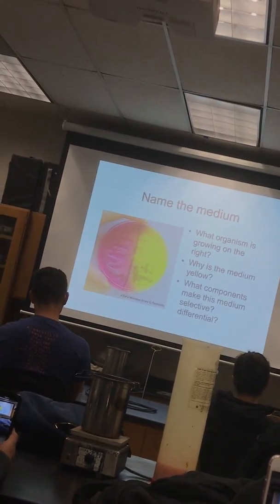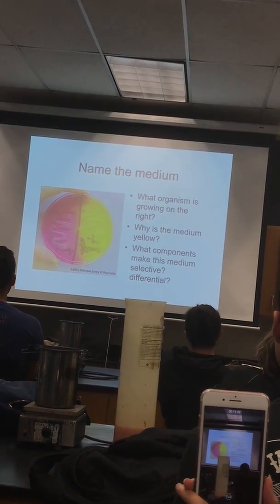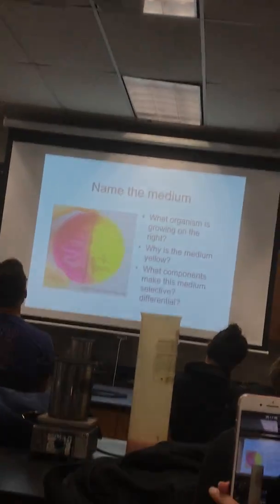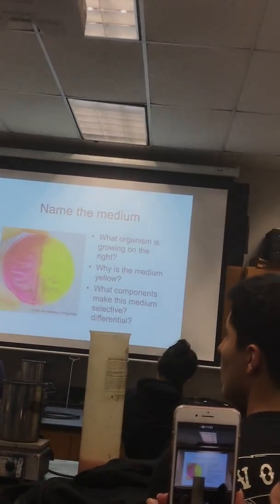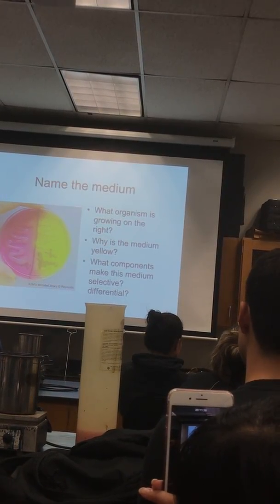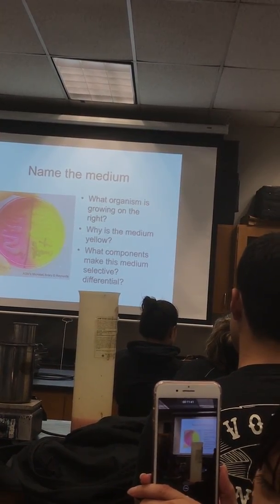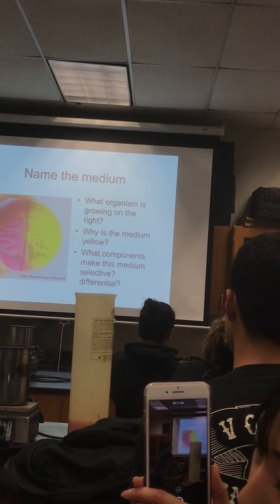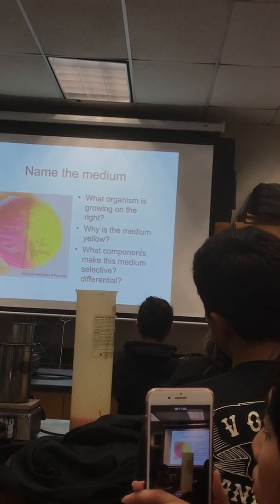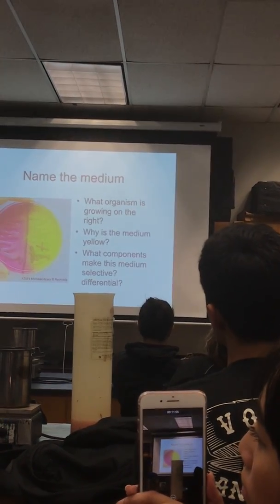So phenol red will turn yellow at pHs below about 6.8. You know, sort of a 6.8, 6.7, and maybe a little orangey. And some of you, when you were doing your carbohydrate test, were going, I don't know, is this really acid? A little bit, but when it gets down to 6.6, 6.4, it will be yellow. If it goes above 8 or 8.4 or a little higher, it changes from sort of a red color to a more fuchsia kind of color, indicating an increase in pH. So again, it's an indicator dye.